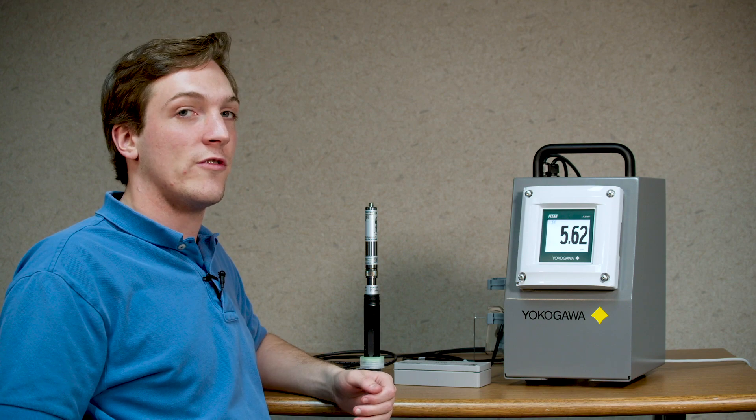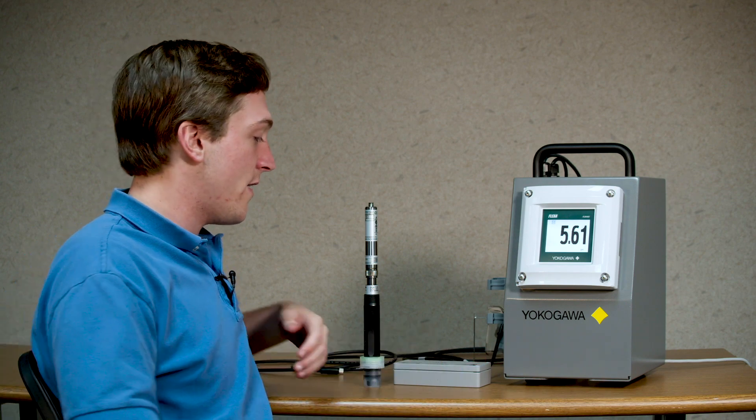Hello, my name is Tyler Ballou. I'm an engineer here with Yokogawa and today I'll be showing you how to configure an additional sensor to the Flexa 402 using the BA11.